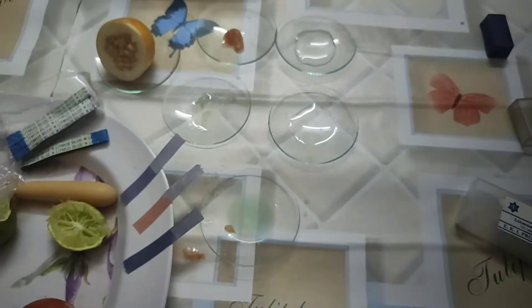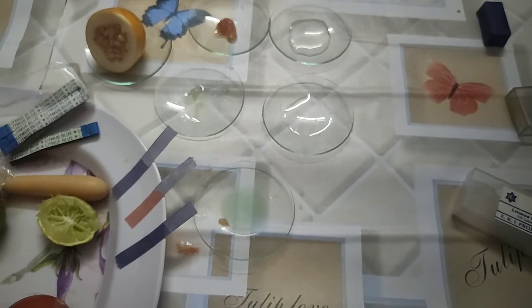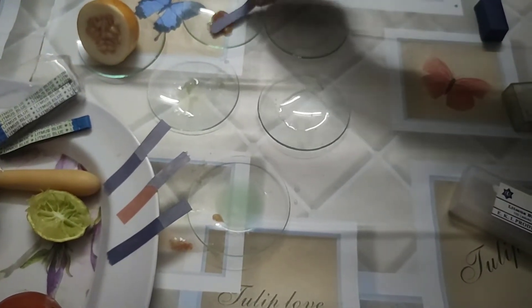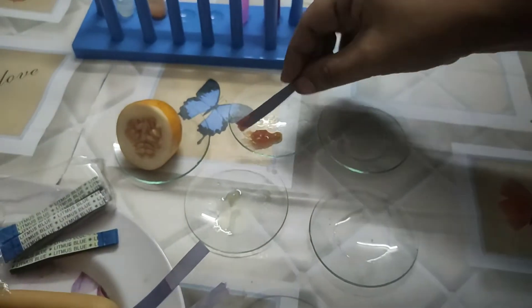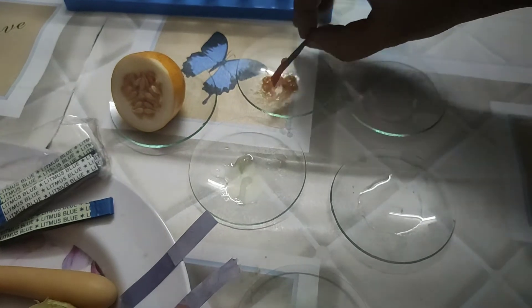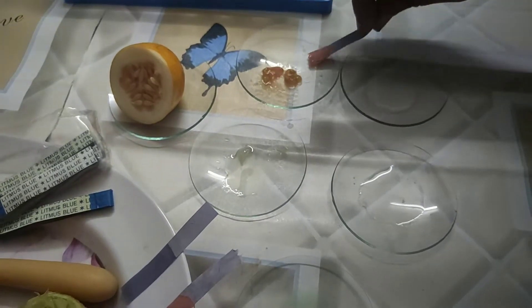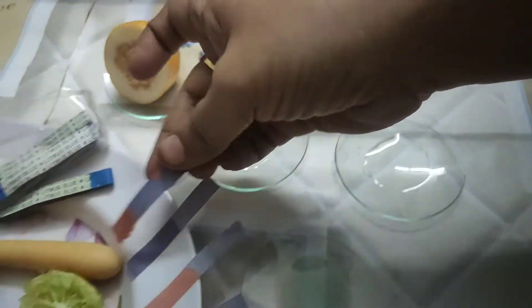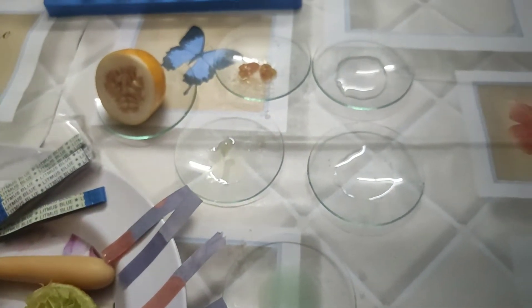One more — I am dipping it in another substance and it also doesn't change, so it is also a basic substance. Now I am dipping it in the tomato — see here, blue litmus changes to red. That means tomato contains acid.